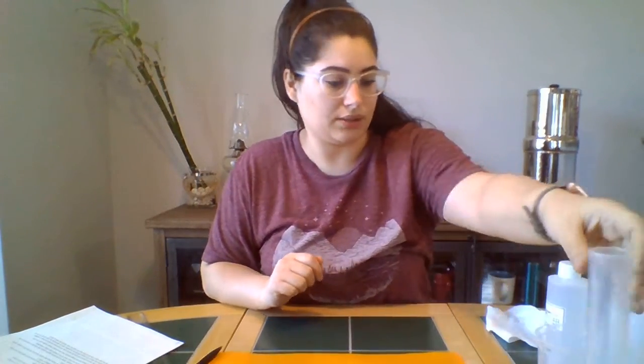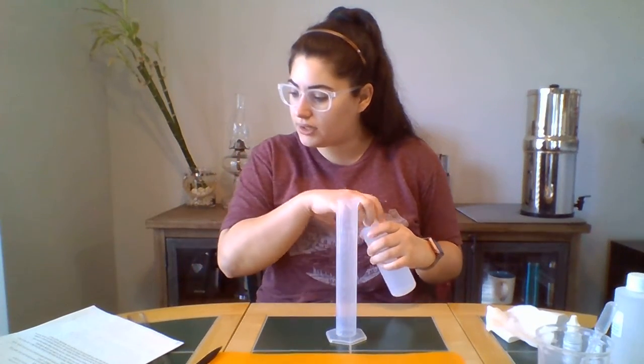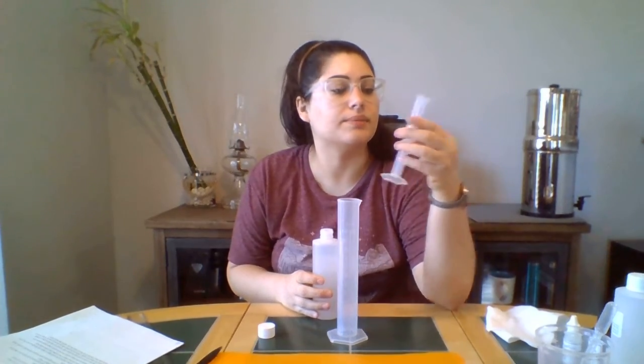Okay. So now that that is done, next step. Measure 150 milliliters of acetic acid or vinegar using the 100 milliliter graduated cylinder and pour it into the 250 milliliter beaker. Gently place all 3 blocks into the acetic acid solution. Okay. So vinegar, and we need 100 milliliters. Or no, 150. My mistake. 150. Because what does this go up to? It goes up to 100 milliliters.